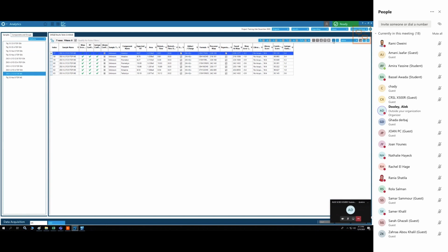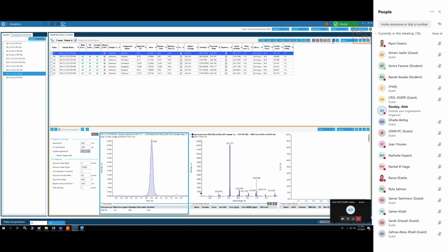Let's go back to the peak review button. Okay, so the ZK is the correct retention time. And now it's correct. Wow. What is happening?